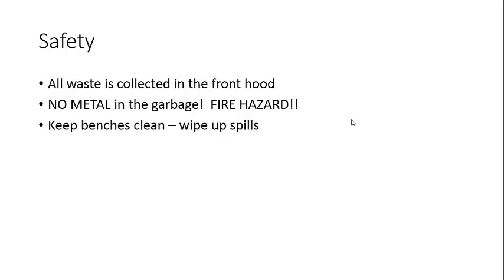Also, keep your benches clean. Wipe up spills as soon as they occur. Keep your hands clean and enjoy this lab because it's a fun one. And that's it.